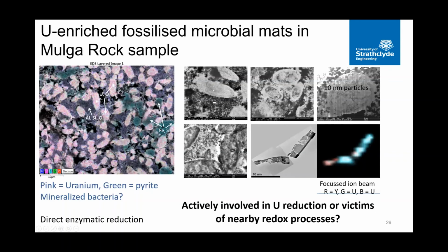Further analysis, and you start to see some features. We took a FIB sample out of one of these, across this one I believe, and another one from elsewhere, and that's them as a combined image there. And to TEM, looking at them more closely, I haven't quite got the room to show you, but we also took diffraction patterns and noticed that there were sort of 10 nanometer shapes within these structures.